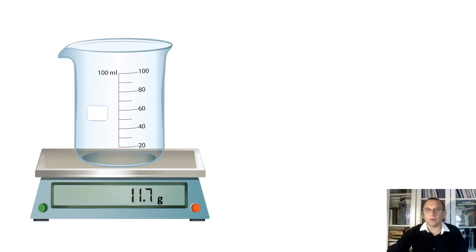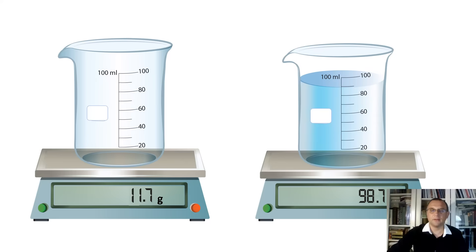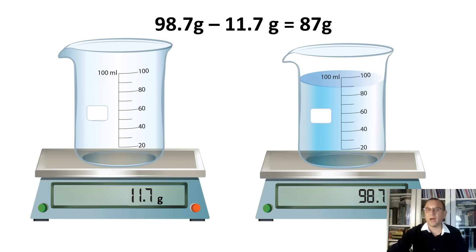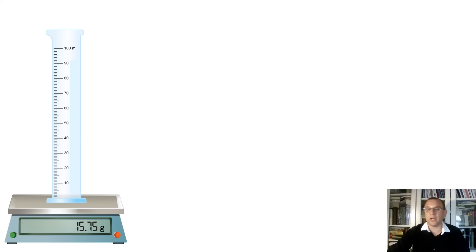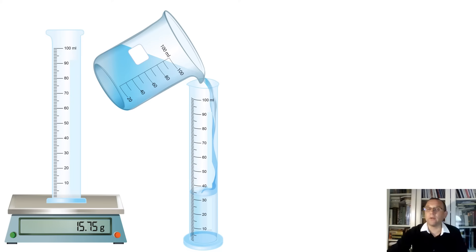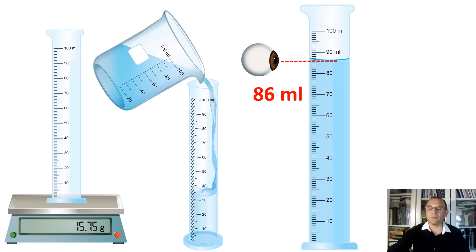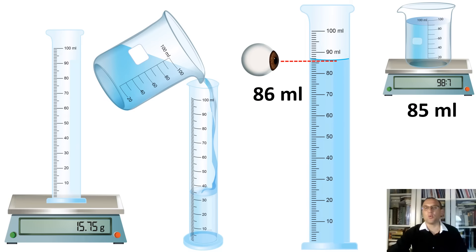Let's measure the mass of an empty beaker first — it is about 11.7 grams. Now we will weigh a beaker with some arbitrary volume of water. On the bigger graduation, you can see it is approximately 85 milliliters. To find the mass of water, we simply subtract the mass of the empty beaker from the mass of the beaker with water, and record these numbers. Now let's weigh the empty graduated cylinder, then pour all the water from the beaker into it to find the precise volume. The correct reading of the volume is at the lowest point of the meniscus — our first estimation of 85 milliliters was very close.